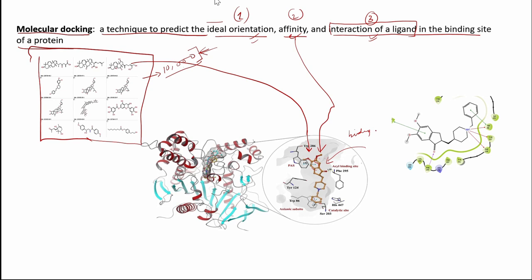So we can look at those top scoring molecules. You can see their interaction also, how they interact at the active site pocket.